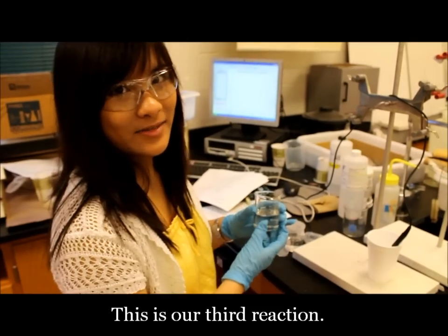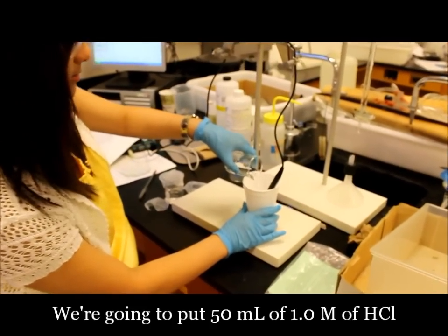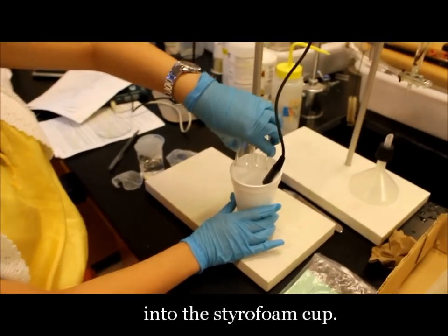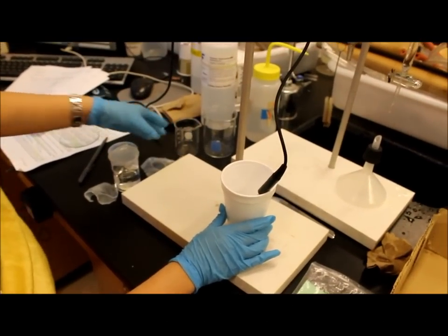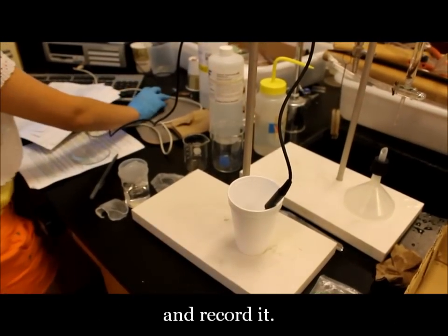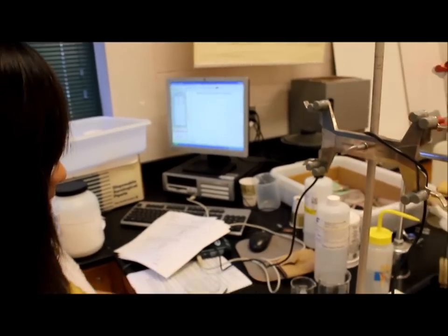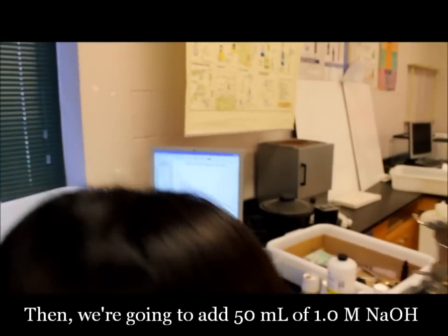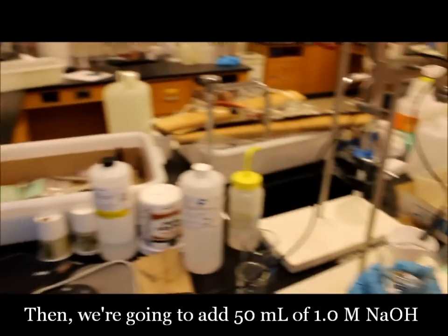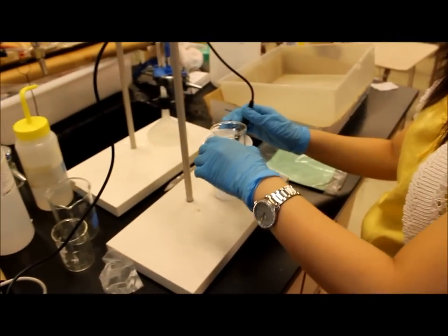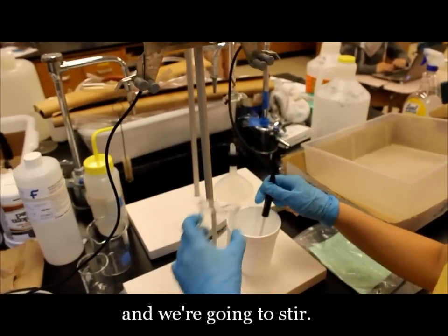So this is our third reaction, and we're going to put 50 milliliters of 1 molar hydrochloric acid into the styrofoam cup. And we're going to measure the initial temperature and record it, then we're going to add 50 milliliters of 1 molar sodium hydroxide to the cup, and we're going to stir.